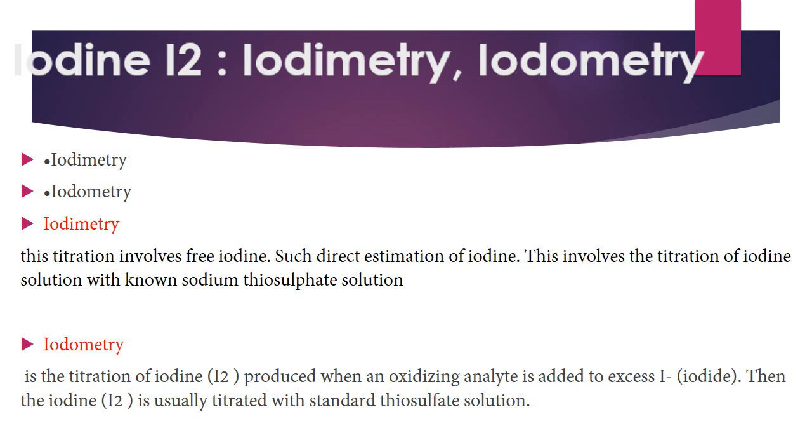The concentration of the sodium thiosulfate solution is known, so it is used as a standard solution. While iodometry is the indirect titration, or indirect estimation, of iodine.